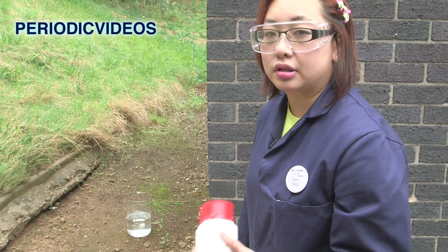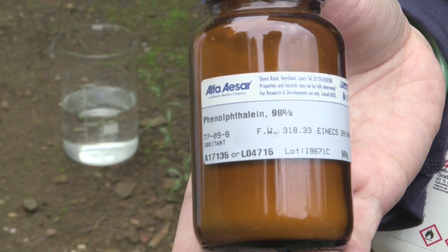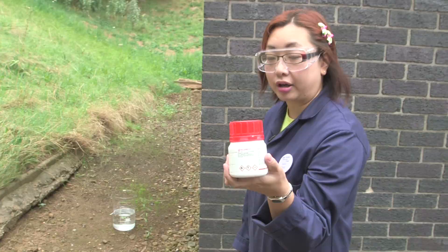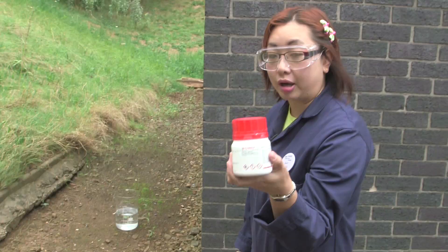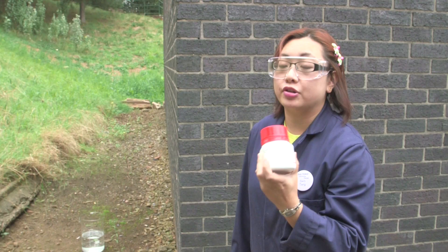We've decided to come outside and try an experiment out here while the weather's nice and dry. What we've got inside that huge beaker is water, and we've put in an indicator called phenolphthalein. At neutral it's colourless, but once we put this other chemical in there — sodium hydride — the sodium hydride will react with the water and it should be a very vigorous reaction.